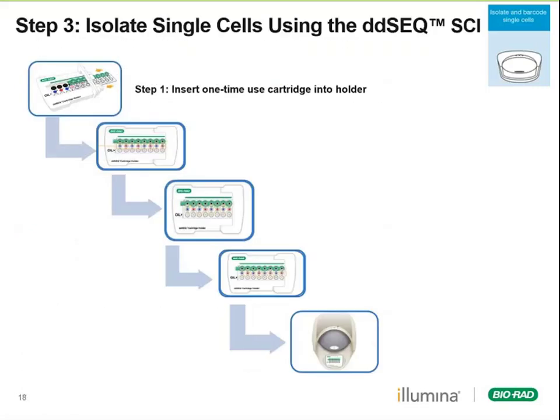Now we're ready to load the ddSEQ SCI. We're going to take our cartridge holder, which has a nice loading guide, and insert a one-time use cartridge. There's great instructions for this in the reference guide.